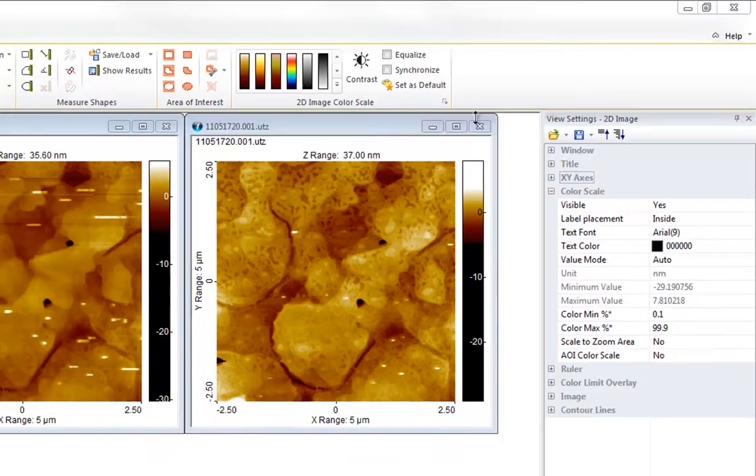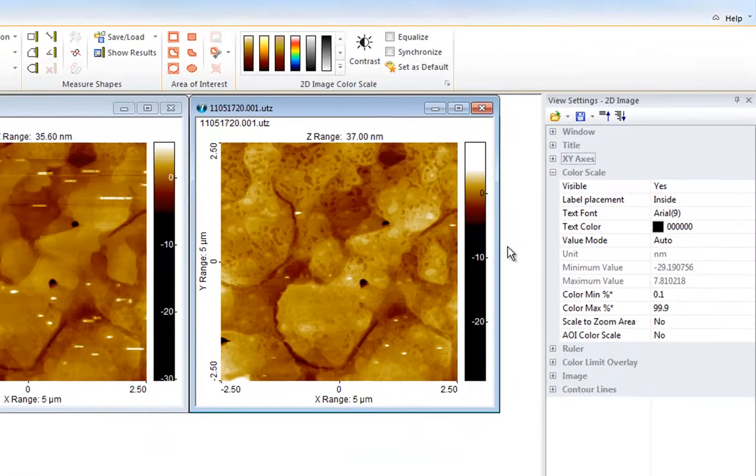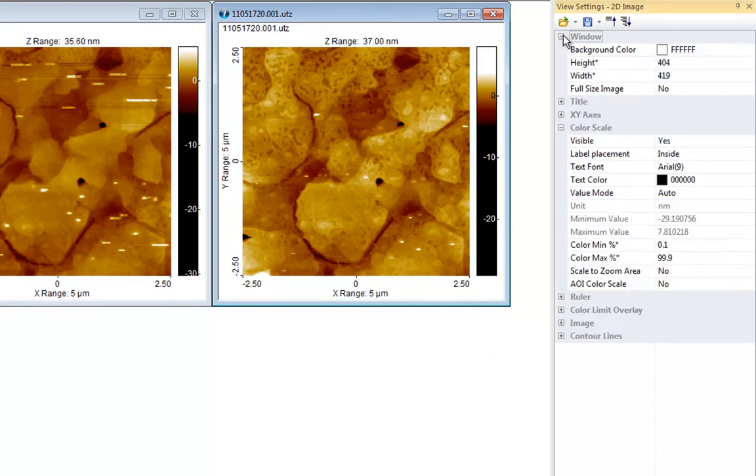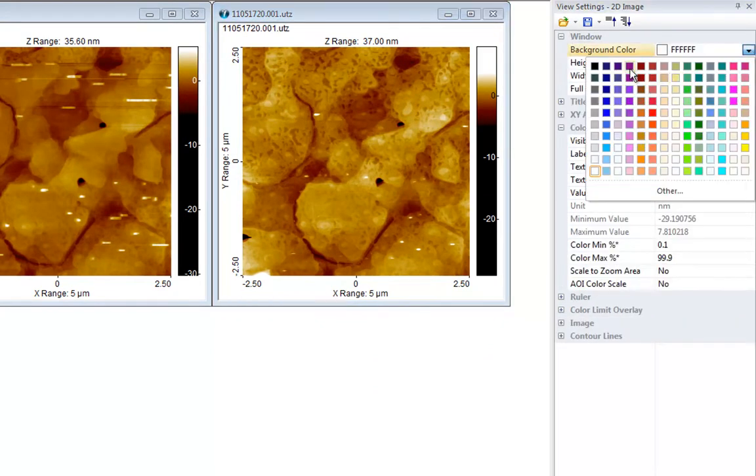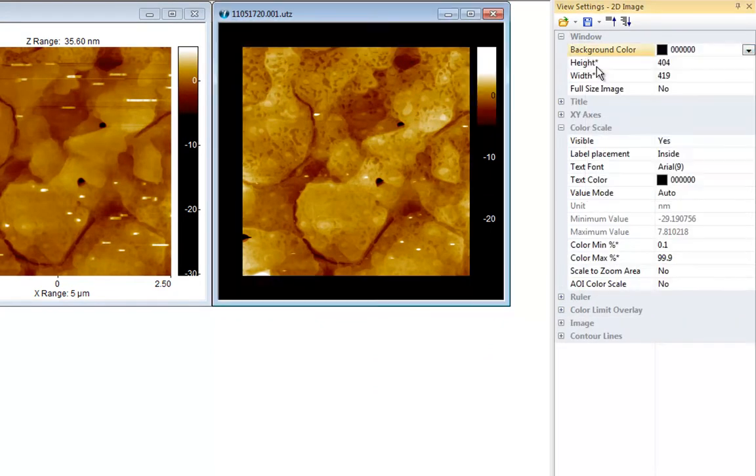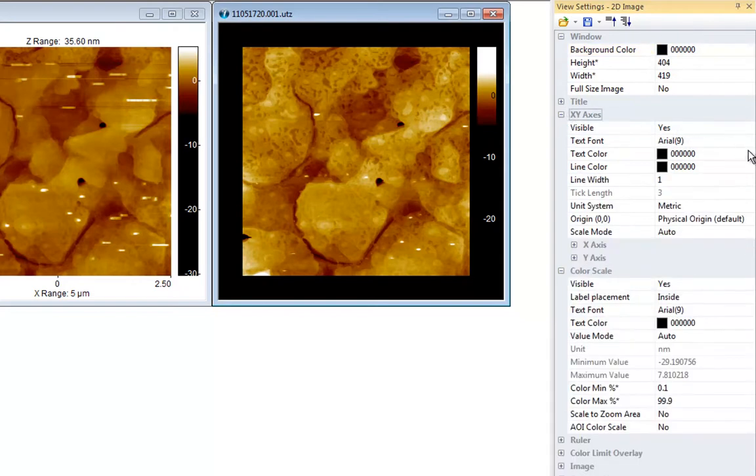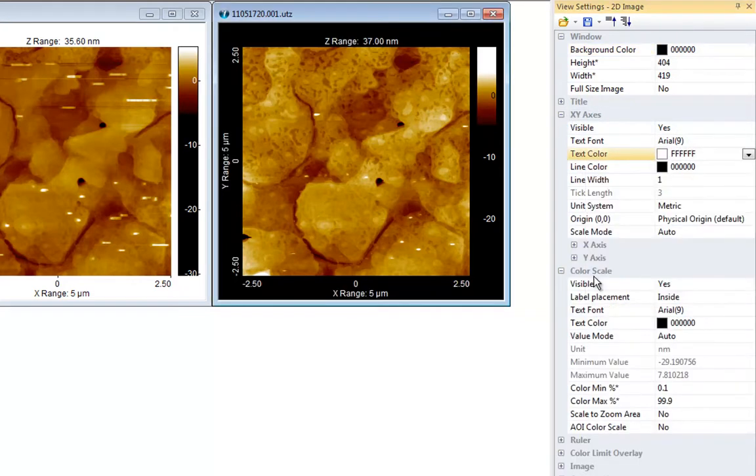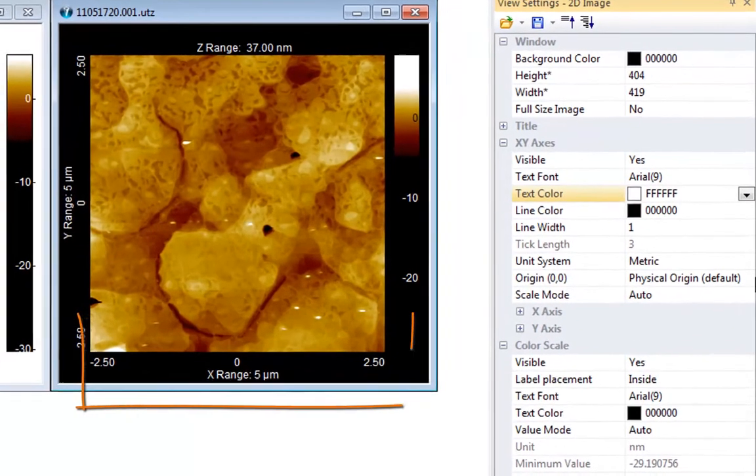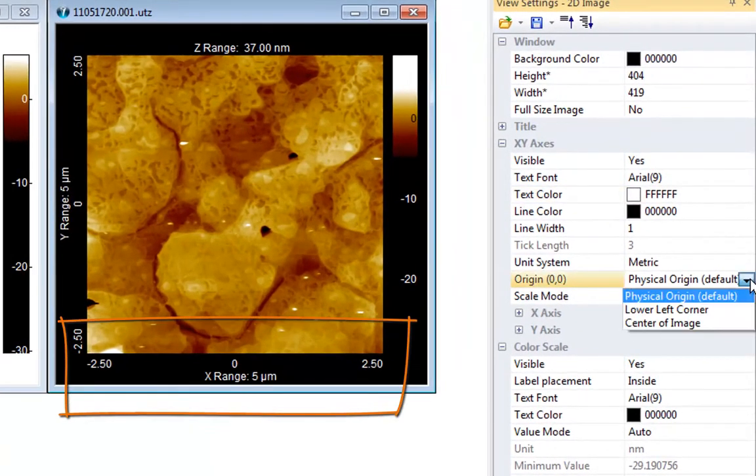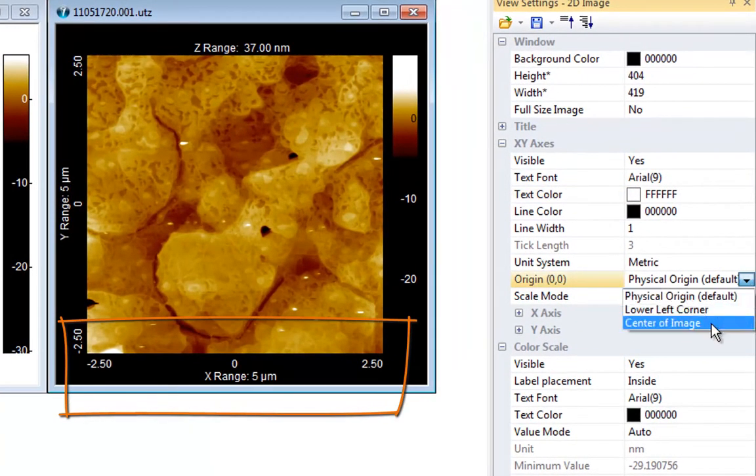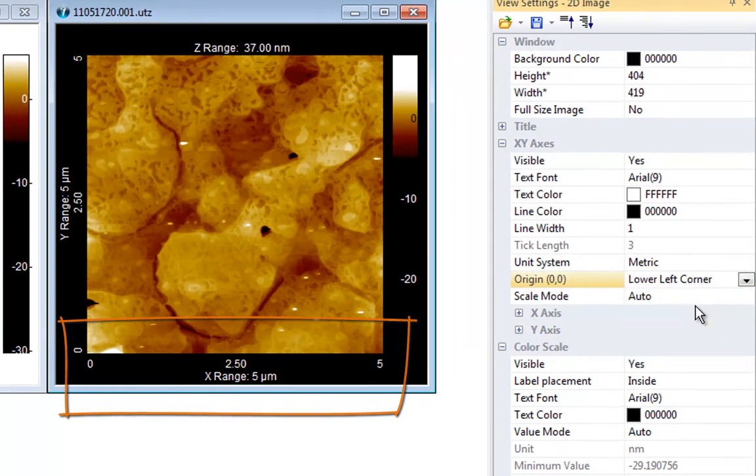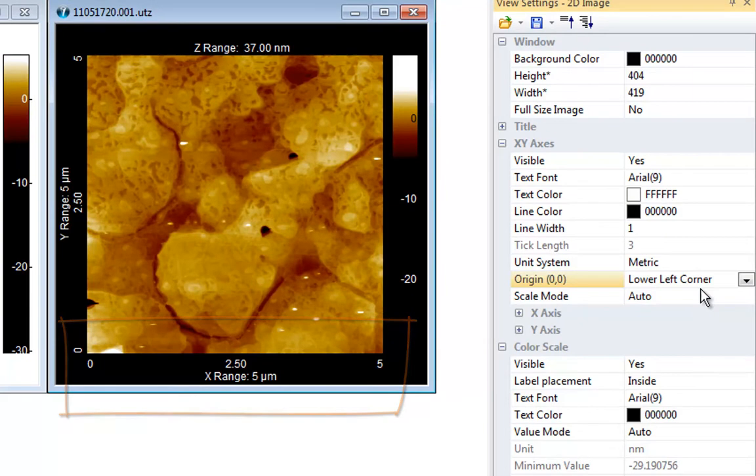In view settings the visual appearance of elements inside windows such as fonts and line widths can be customized. But there are also other things which can be controlled from view settings. For example the way the axis labels are displayed, if they should reflect the offset of the scanner, or should have their origin clamped to either the center of the image or the lower left corner of the image.